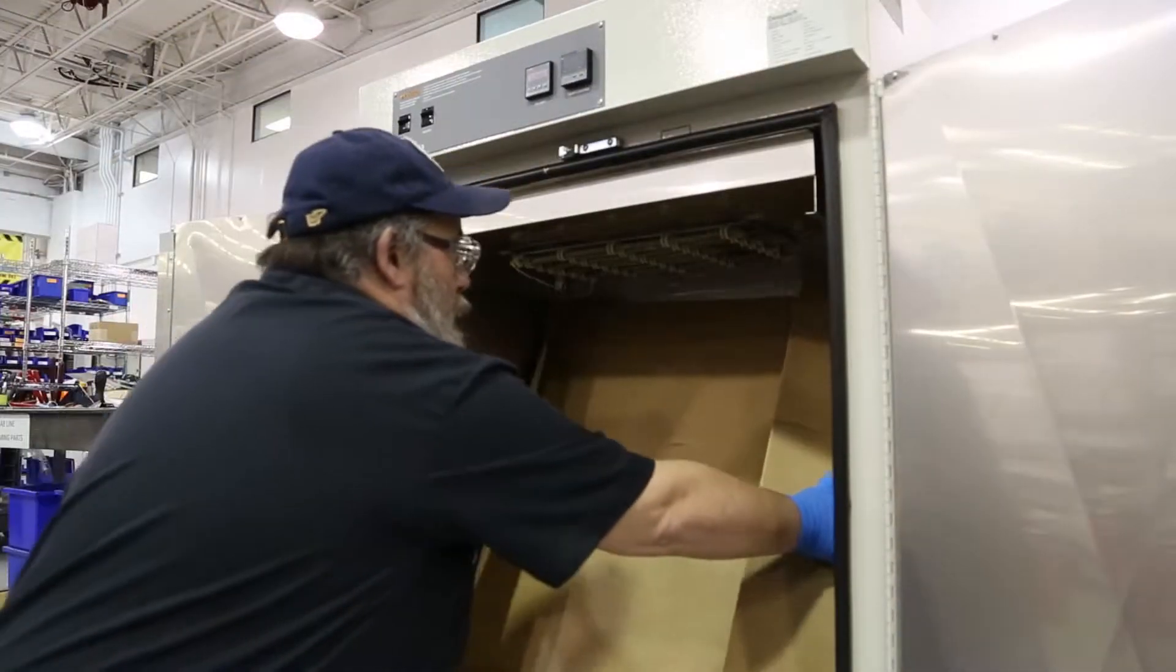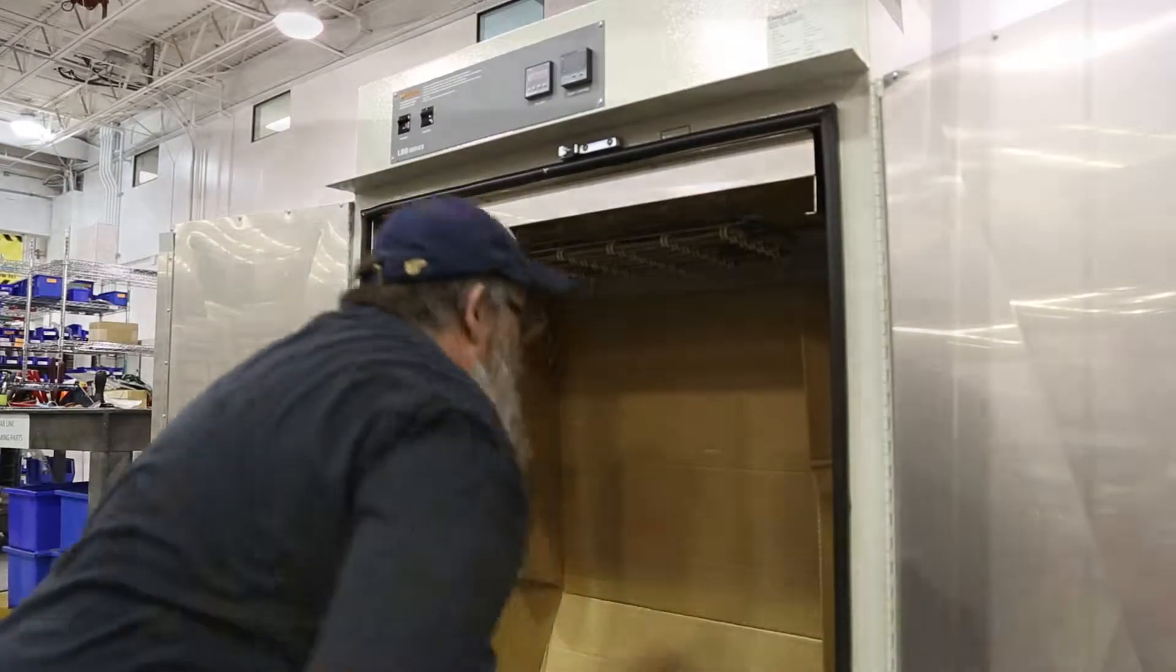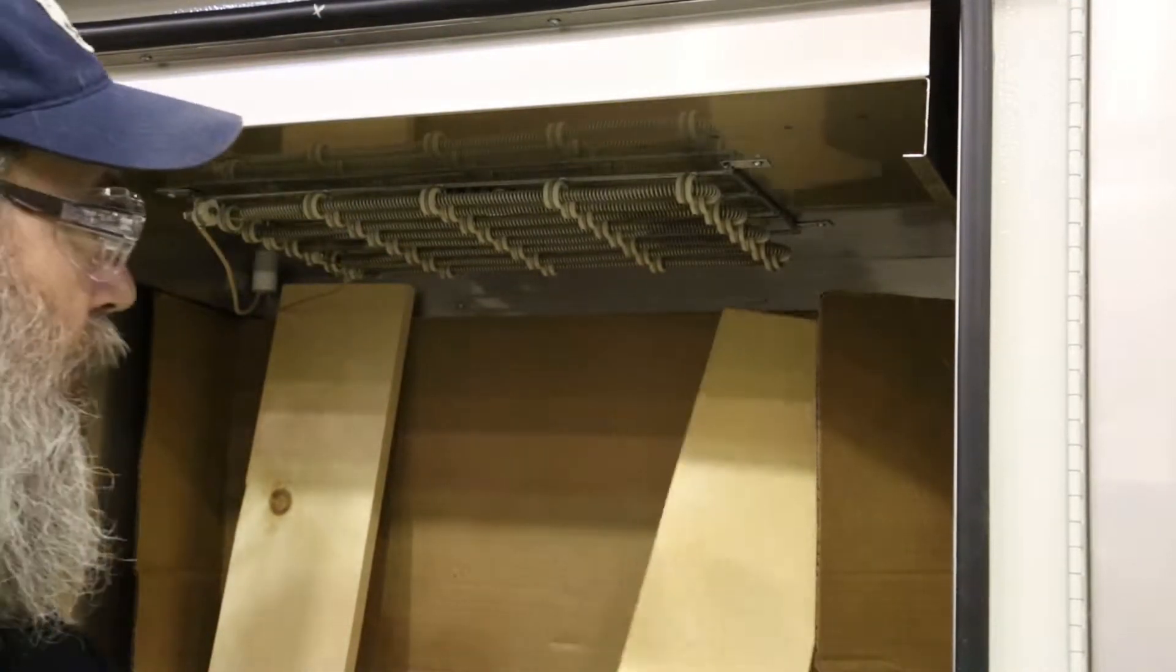Insert a sheet of cardboard to protect the interior of the oven. Insert two boards cut to the height of the chamber to support the back end of the ceiling.